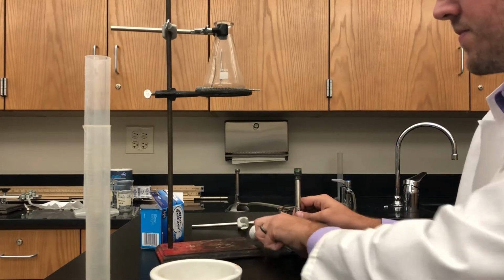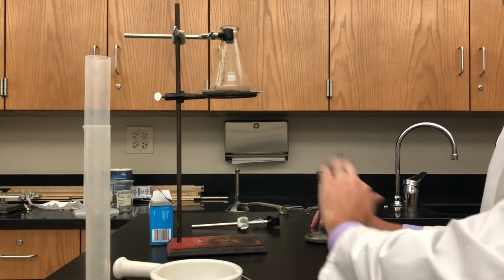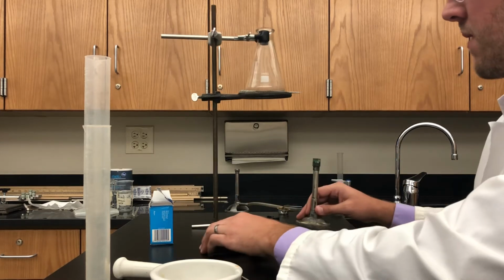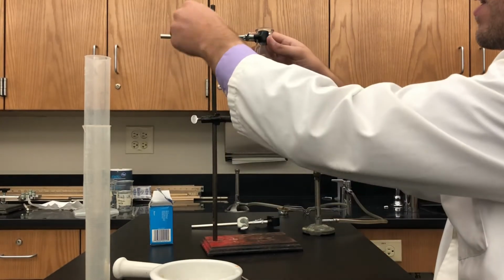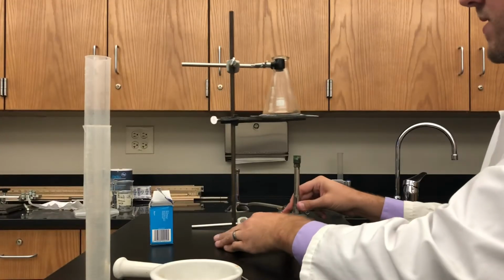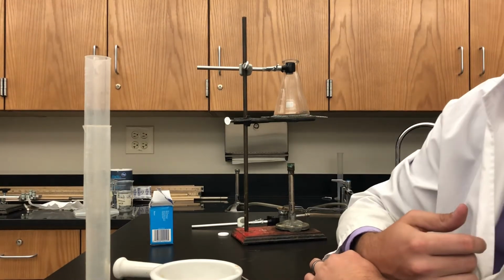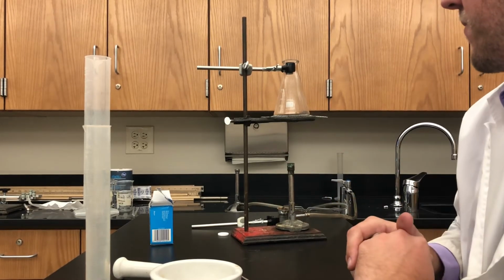And what I recommend is do not light your Bunsen burner underneath this whole setup. Get it lit first. Adjust the flame so it's a nice, smaller cone, and then you can adjust the height of this. So oftentimes we'll do that first, then that, and then you can place it underneath there. You don't want to have to adjust this once it's hot. I can help you with that if need be, but it's not very easy. So get everything adjusted and ready to go first, then start heating.